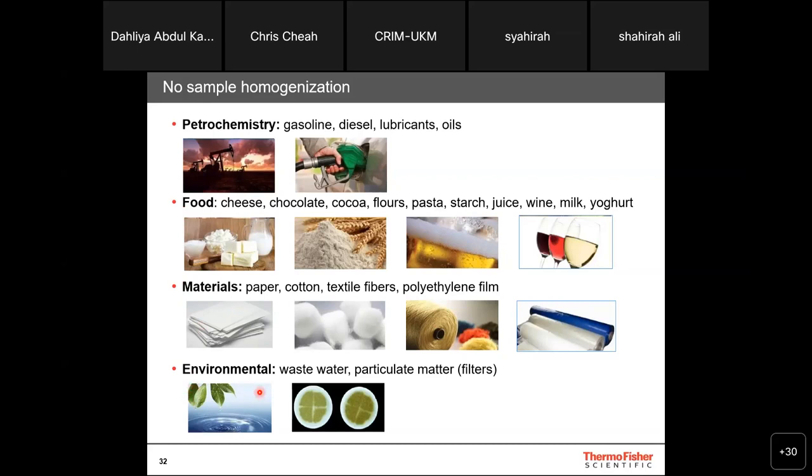So you see there's a filter paper. I can just run 1 liter of wastewater or 1 liter of environmental water through this filter. Afterwards, we dry the filter in oven. Why do we need to dry it? Because we want to remove water content. Okay, so after we dry it, we can cut them, fold into a capsule, start analysis.